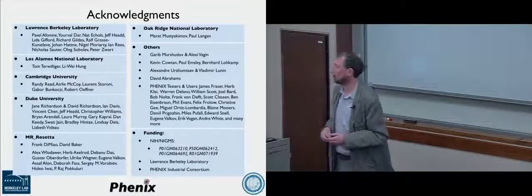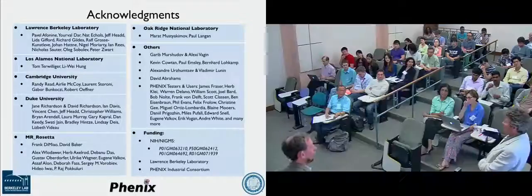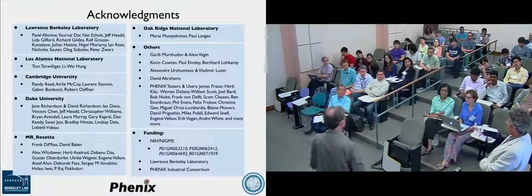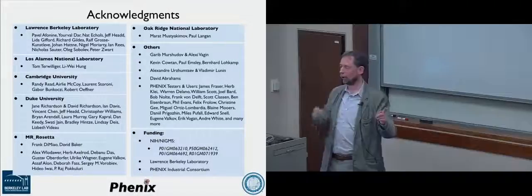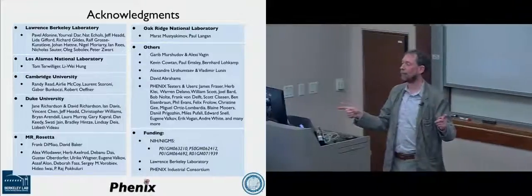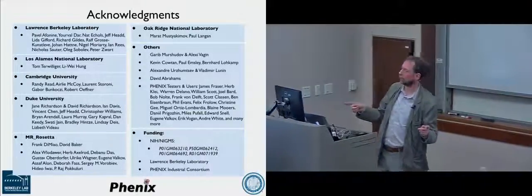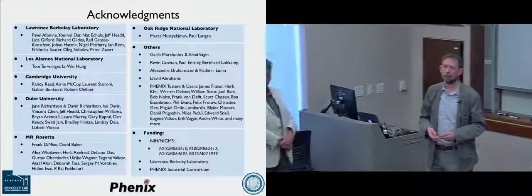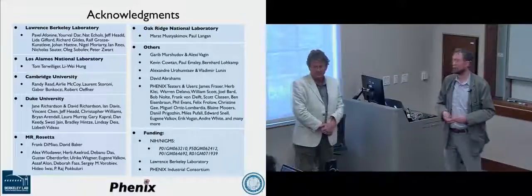The presumption is that those are intermediate results, not necessarily germane to the final quality of the coordinates, right? That's the presumption. That has been a presumption, but of course knowing about how you got to that point can be very informative. And if anybody else wants to reproduce your work at the end of the day, they need to know that. It's very useful for developers and everybody else as well. It's a wealth of information.